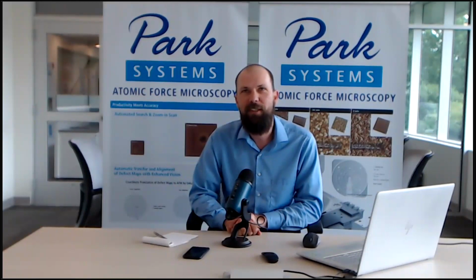Today's presentation is on the topic of QCM and ultra-thin films in tandem with AFM.